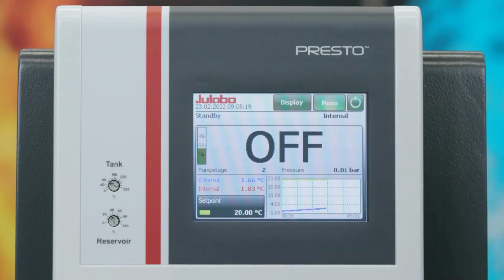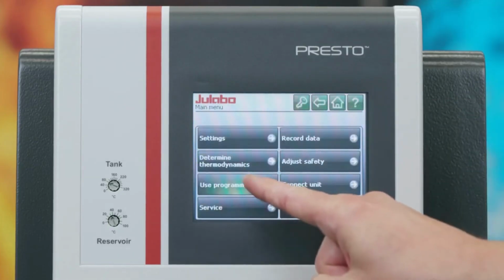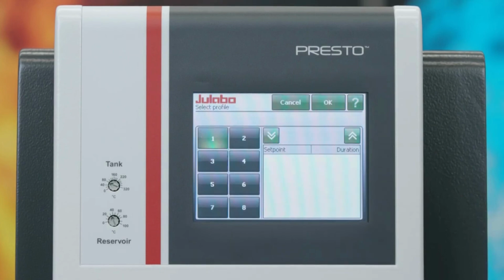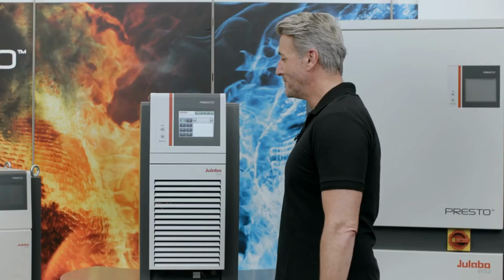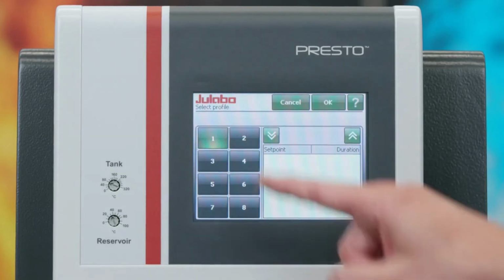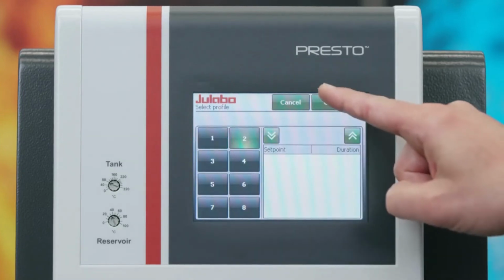You can find the so-called programmer in the submenu Use Programmer. To manage temperature profiles, simply tap on Edit Profile. Up to 8 different profiles can be predefined. I will show you an example. To edit one of the profiles, choose the profile and then OK.